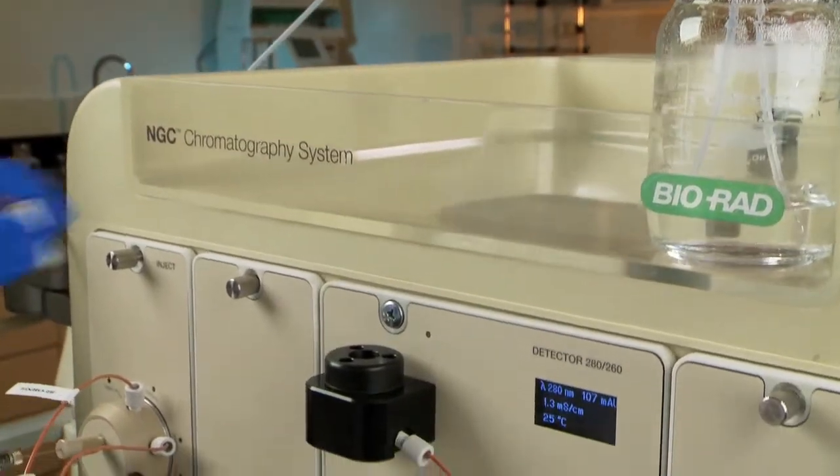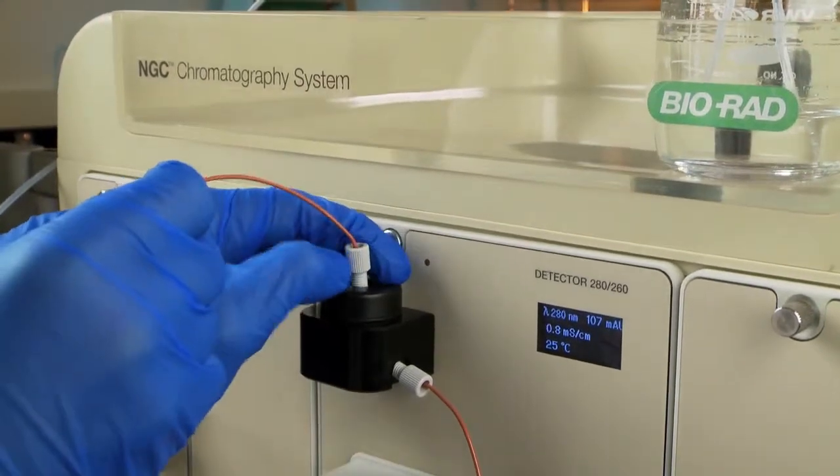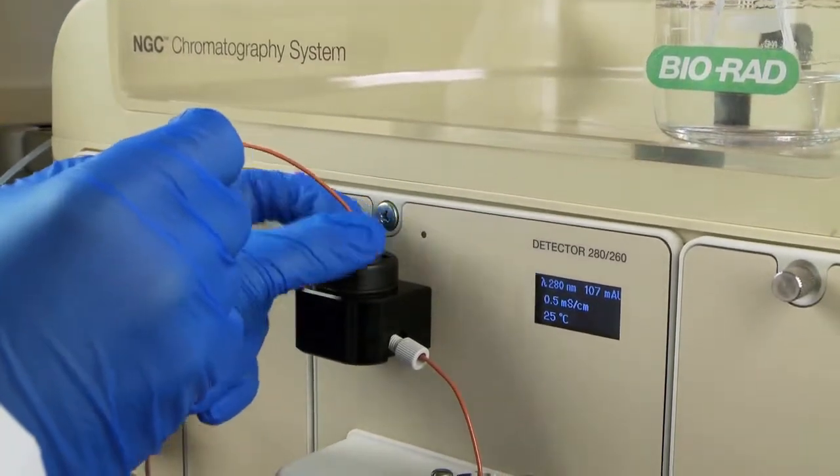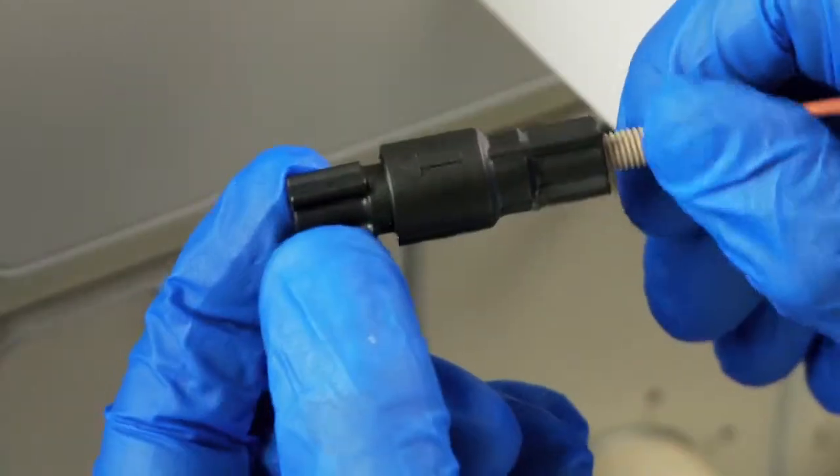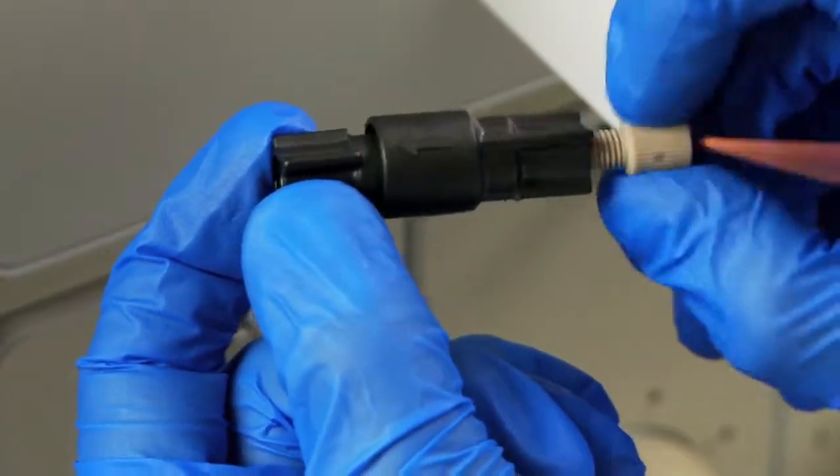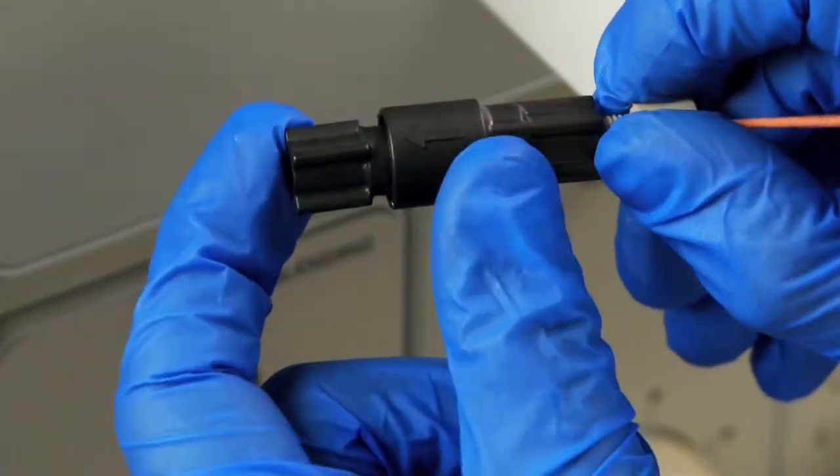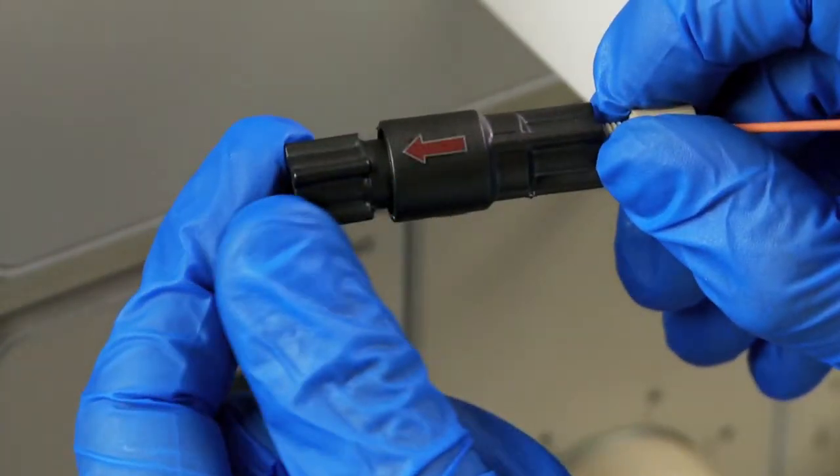Now you will attach the back pressure regulator. Connect line number 2 into the top of the conductivity monitor and then connect the other end into the 40 PSI back pressure regulator. The arrow on the body of the regulator should point in the direction of flow.